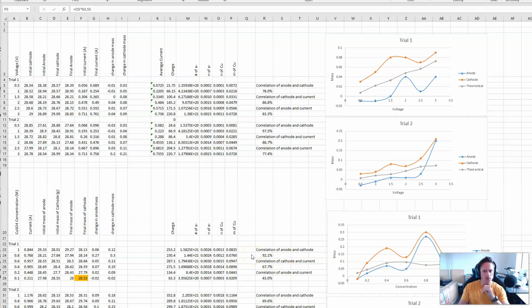Just want to talk us through the results we obtained for our electrolysis design practical. So basically I've constructed a bit of a spreadsheet for you guys to utilize with your report. So I'm just going to talk you through what it is that we've done.